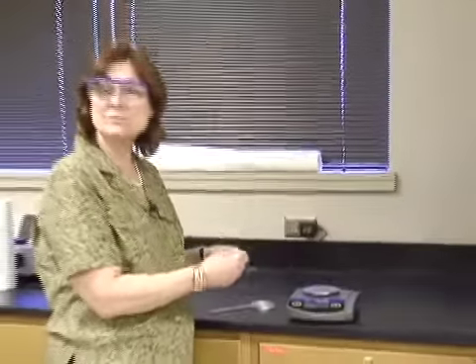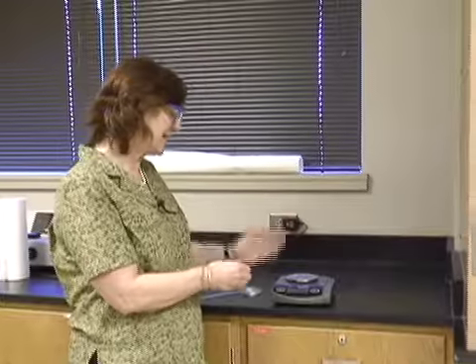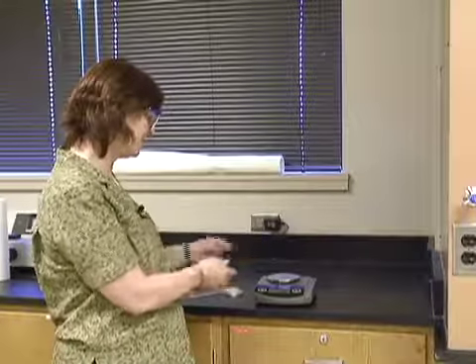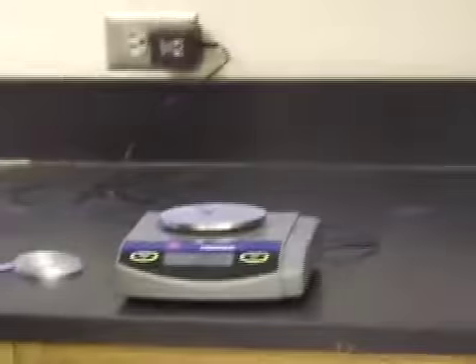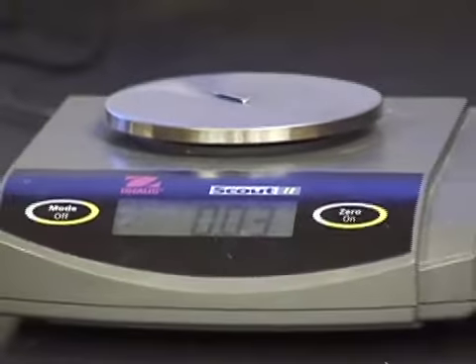Now, this lab is not going to be great on accuracy, therefore I'm just going to do the best that I can and we'll go with the numbers that we have. Now, this scale will only measure to the hundredths place, and it would have been more accurate if I had used an analytical scale that has more decimal places. But for our purposes, this will be just fine. And the mass of the magnesium is 0.03 grams.